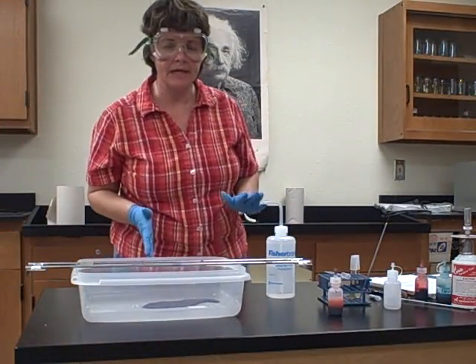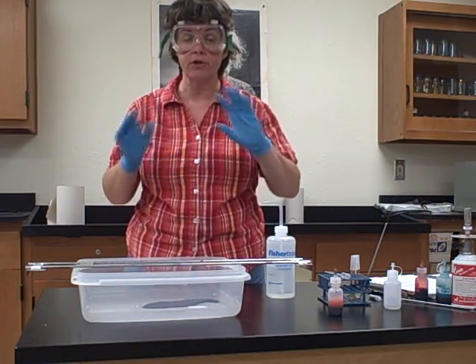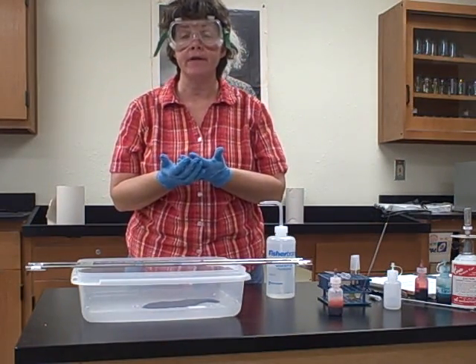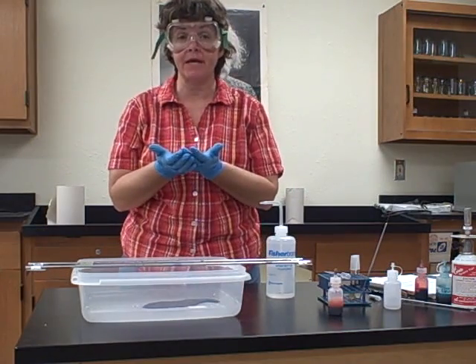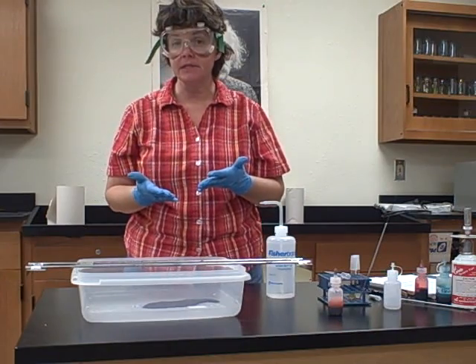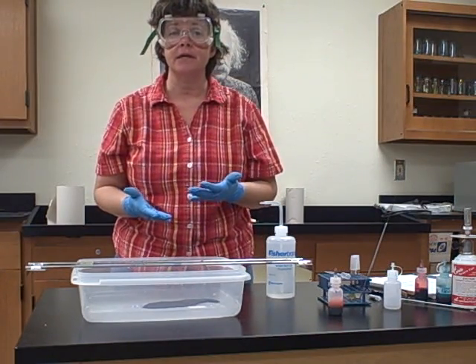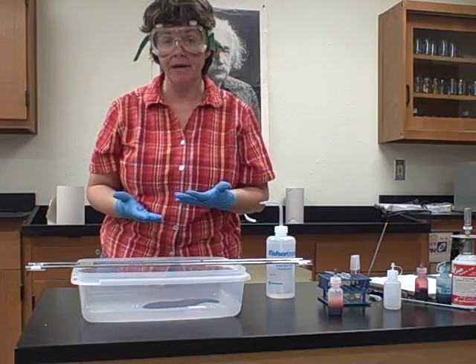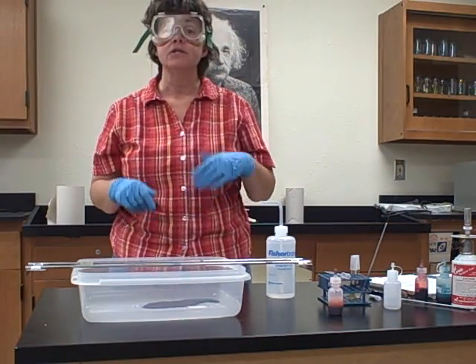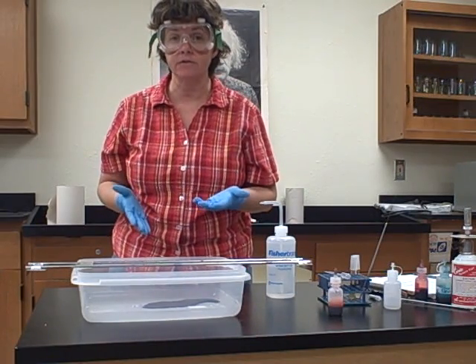Okay, now this is the capsule stain. Capsules are a thick polysaccharide or sugar layer around the wall, outside the wall of the bacteria. And if a bacteria has a capsule, that means that it's more virulent. Virulent means the degree to which a bacteria is pathogenic or can cause disease. So having a capsule allows those bacteria to resist phagocytosis.